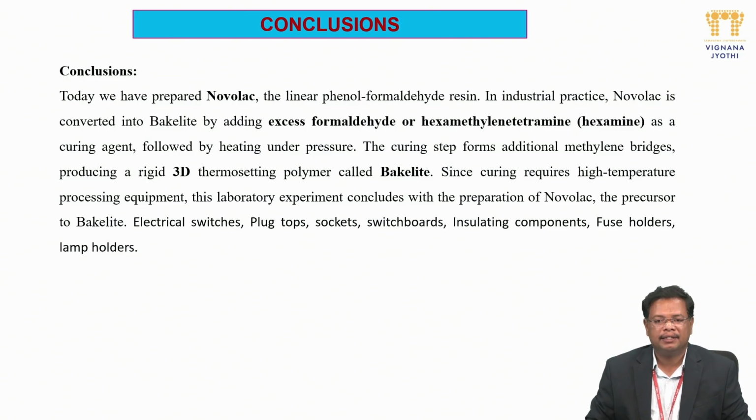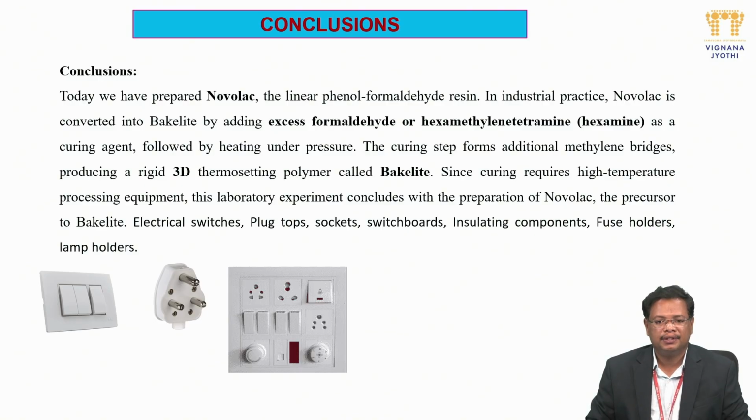Since curing requires high-temperature processing equipment, this laboratory experiment concludes with the preparation of Novolac, the precursor to Bakelite. This product is widely used in electrical switches, plug tops, switchboards, insulating components, fuse holders and lamp holders.